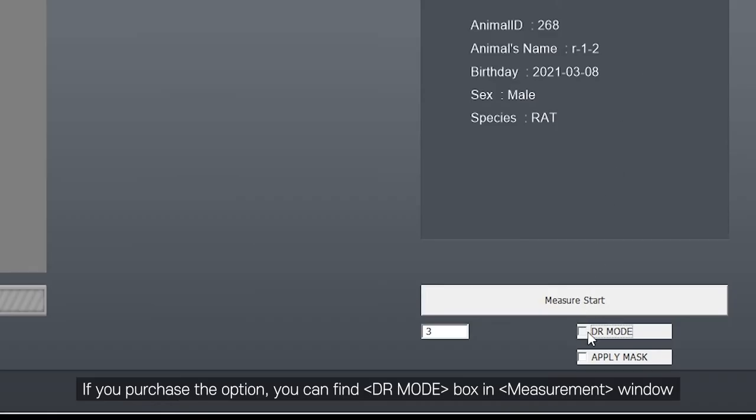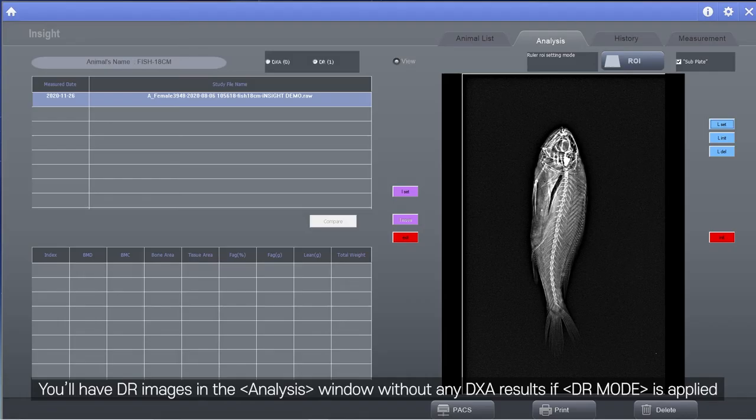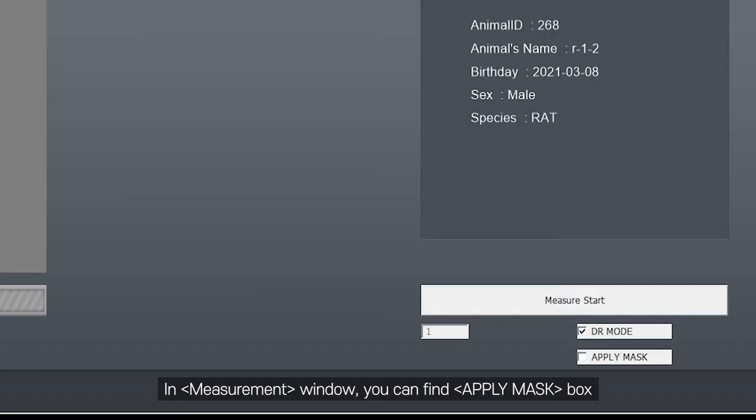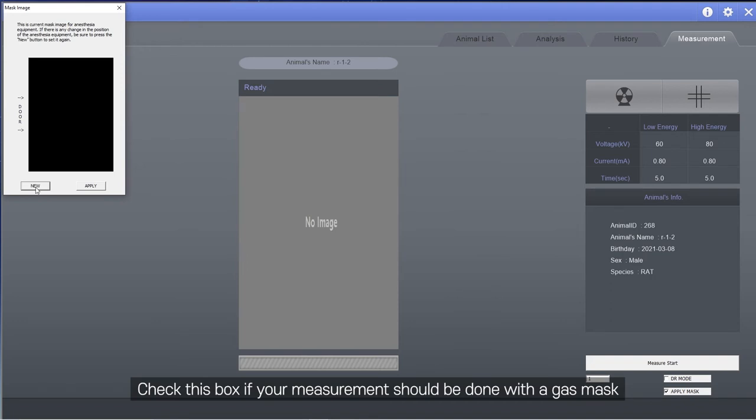If you purchase the option, you can find DR mode box in measurement window. You'll have DR images in the analysis window without any DXA results if DR mode is applied. In measurement window, you can find apply mask box. Check this box if your measurement should be done with a gas mask.